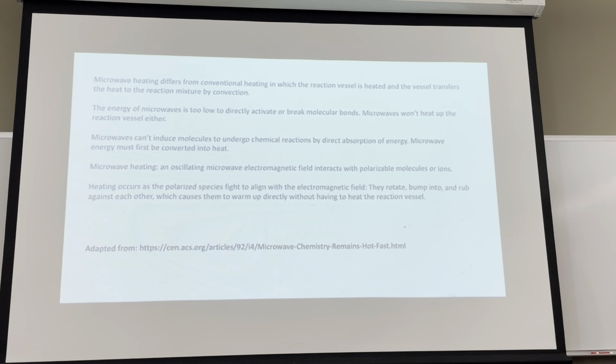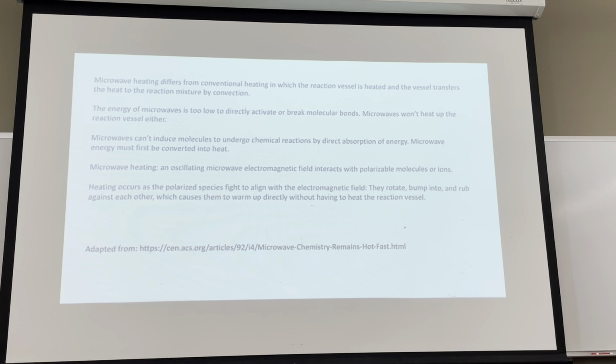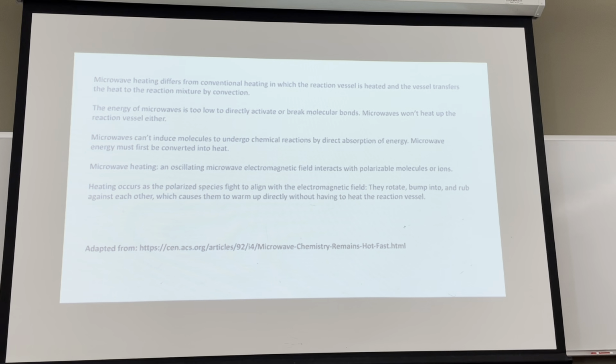And the source of that heating is that microwaves, being on the electromagnetic spectrum, induce changes at the molecular level, kind of like a spectroscopic thing, you know? The changes that microwaves induce are changes in rotational modes. So if you have polar molecules and you put them in the presence of microwaves, it'll cause the molecules to start rotating. And this rotation causes, you can almost think of it as molecular friction. That's what is the source of the heat.